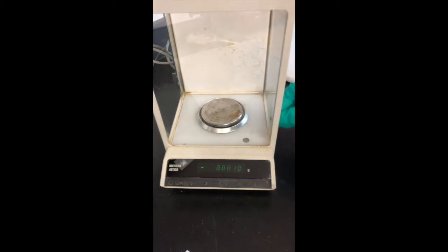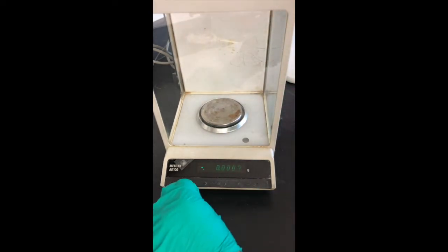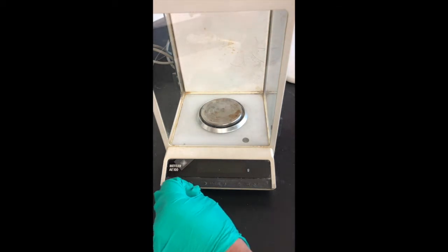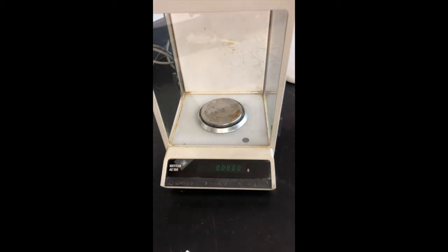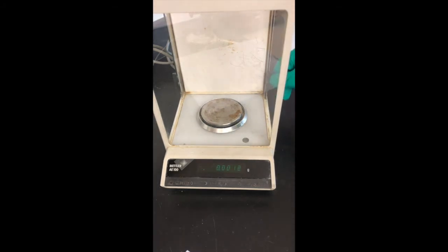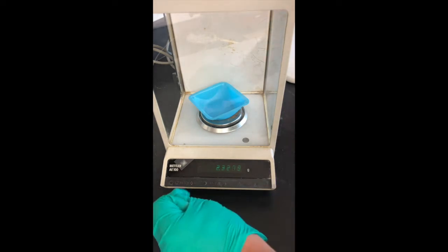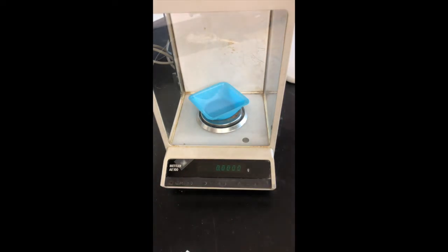We have our cage here, which I will close and re-zero, like so. It might take a bit to stabilize, and you may have to re-zero again. Once you're at zero, we're going to be using a plastic weighing boat for this part. So this is step one of Experiment A. Get our plastic boat on there, and we will tare it by pushing re-zero.